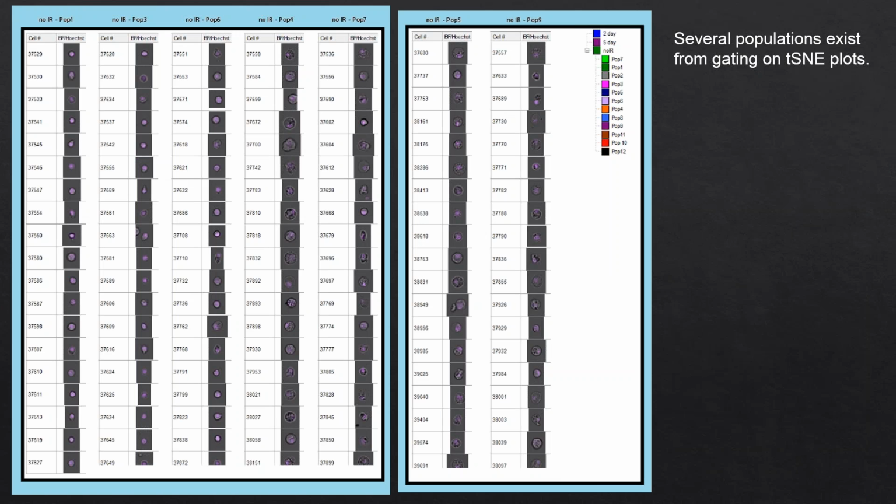And so what we did was prep disaggregated worm samples from non-irradiated, 2 days post-radiation and 4 or 5 days post-radiation, and ran them on the ImageStream. And so, again, we're looking at bright field, side scatter, and DNA. In this case, we used Hoechst, a live cell assay, because there's a protocol already worked up where you can disaggregate animals, stain them with Hoechst, and through a side population type of approach, sort out these stem cells for transplant. And so that workflow already existed, so we used that to make these preps to run on the ImageStream.